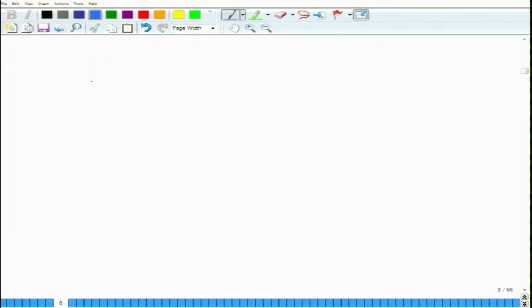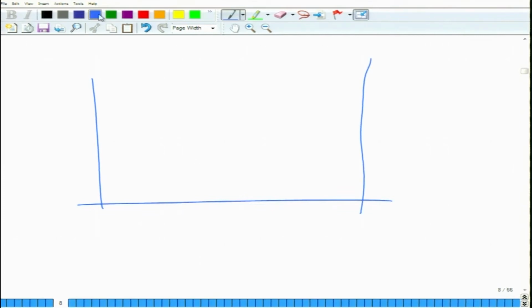So what you will see normally is that if you draw the intensity versus 2 theta, the peak for a very thick crystal would be something like that, whereas it is broader for a crystal which is of small size, which has smaller grain size.